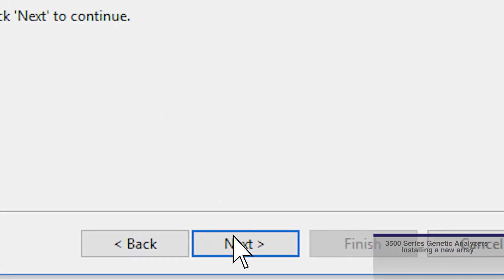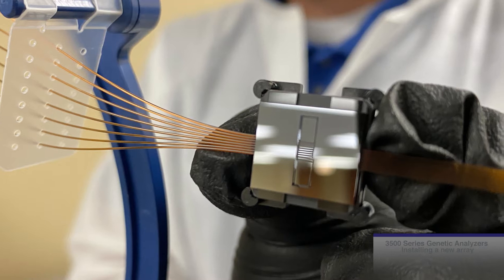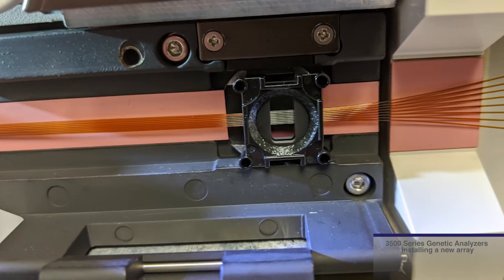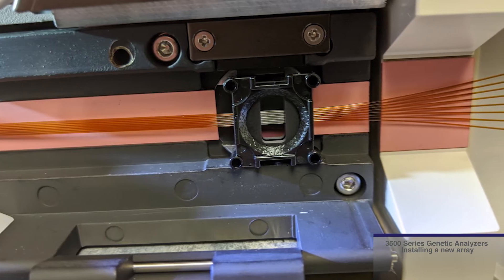Once tightened, click Next. There are four prongs on the corners of the detection cell, and when properly installed, they fit and lock the detection cell in the detection cell heater block.